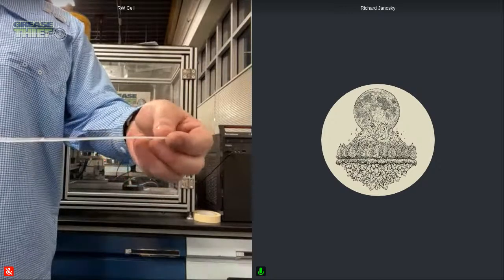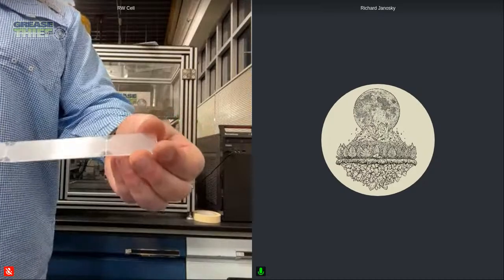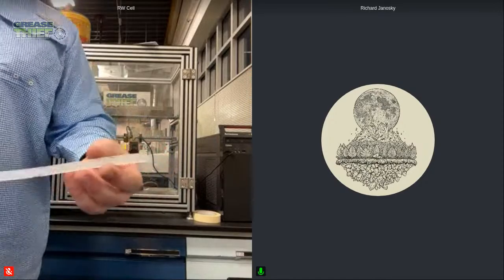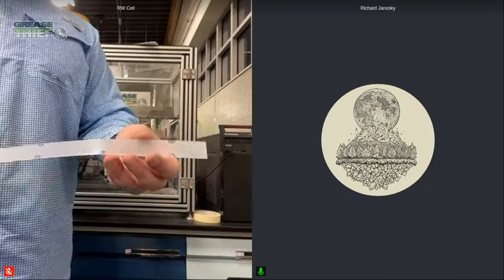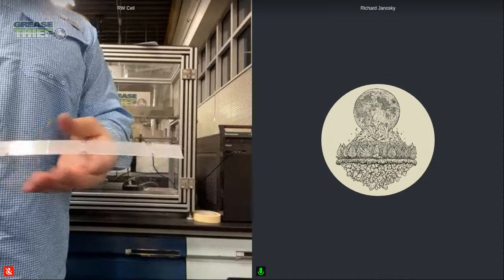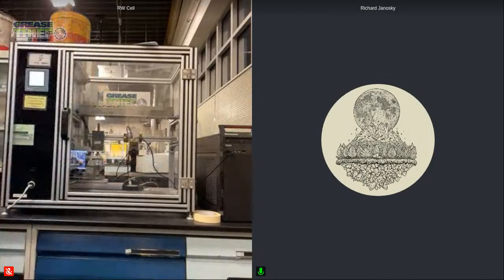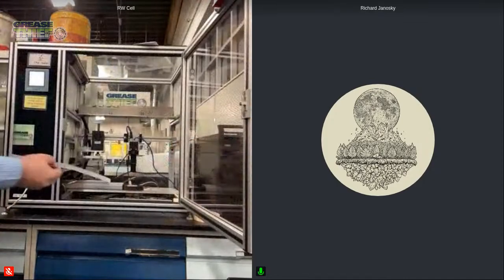One's the base that supports it, and then the top is a thin layer that you can see those individual lines on there that are pre-cut. And then once the sample is extruded, we'll be able to pull off those individual sections. And then each section, as you've seen before in the training during boot camp in the pictures, is that, 2 would be for RDE, 1 would be used for color, 1 would be used for FTIR, 1 would be used for moisture.